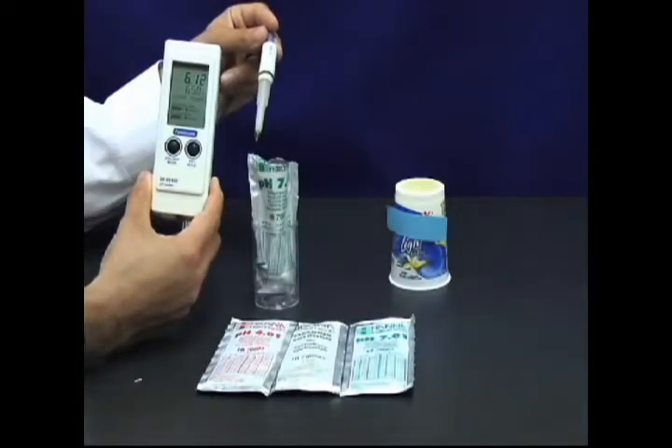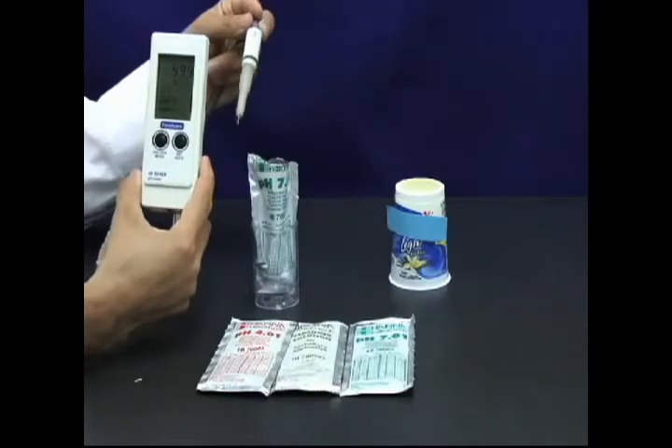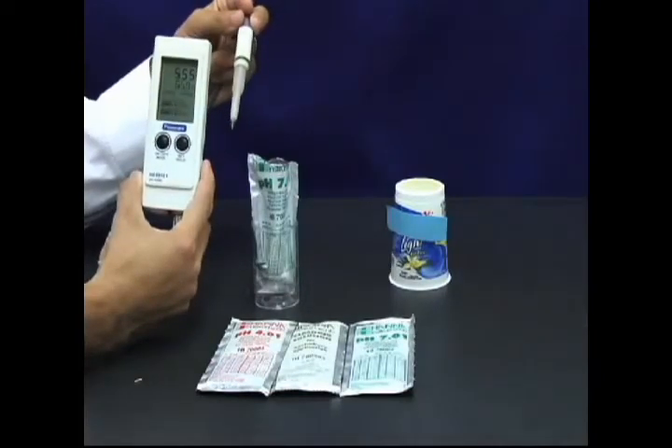Hanna Instruments HI-99161N is one of the most accurate and easy to use food and dairy pH meters. The meter comes with two buttons and a special conic tip designed for semi-solid samples such as cheese and yogurt.